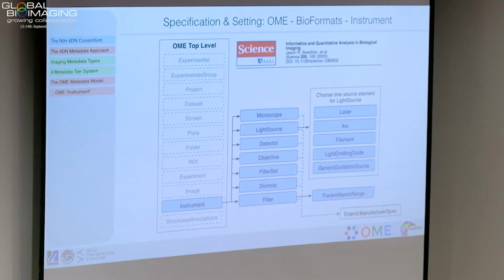So metadata. We weren't starting at zero. Well, the 4DN was starting at zero because we worked off the ENCODE system. There was basically nothing about imaging, but Jason has done a lot of work there for a long time. And so we looked at this system, we made a long list, a couple of 70 or 100 values, that we need to know to actually interpret a live cell imaging system. And could we fit it in here? And when we said no, but there's also data in here that I don't need for an easy experiment. So we went ahead and Jason heard of this list at some sort of weird online meeting we had. And I was like, you guys need to work this out.